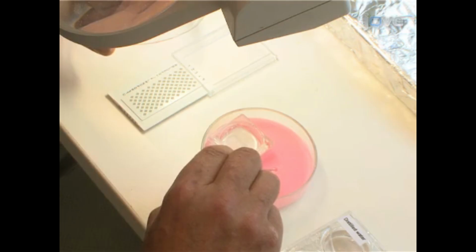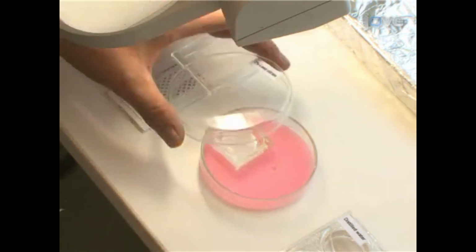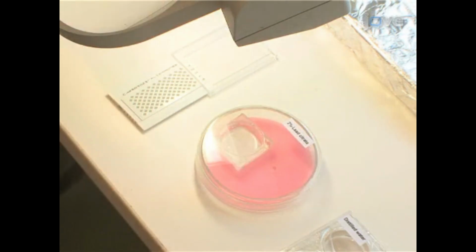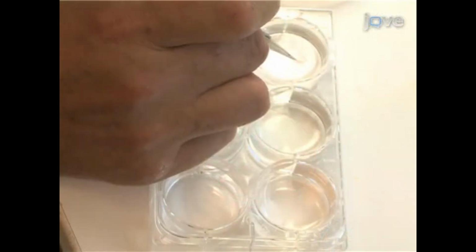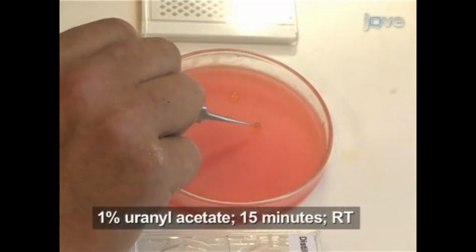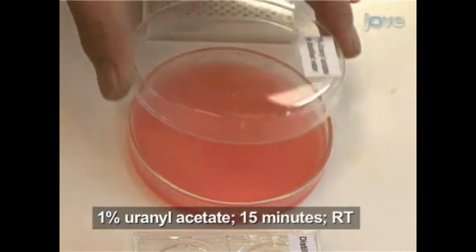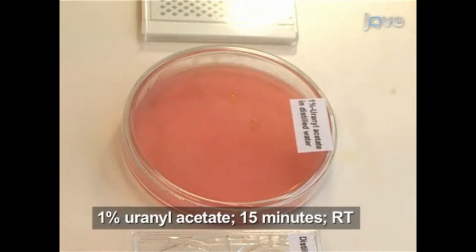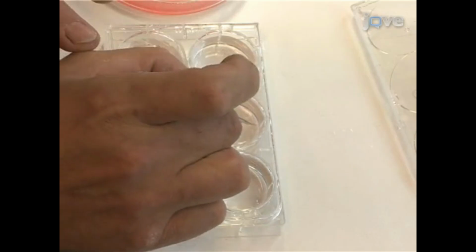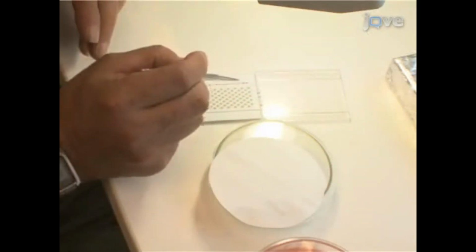Post-stain the sections on the grid with lead citrate for 5 minutes in a petri dish partially filled with NaOH to create a CO2-free environment. Wash the grids with distilled water for 1 minute. Finally, post-stain for 15 minutes with 1% uranyl acetate dissolved in distilled water at room temperature. After washing the grids with distilled water for 1 minute, air dry in a grid box.